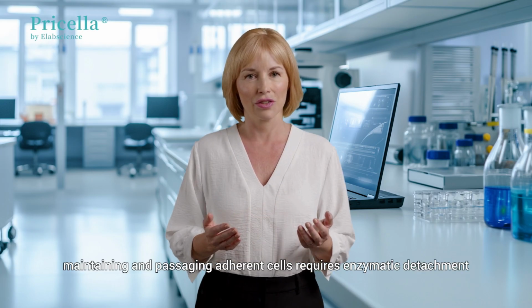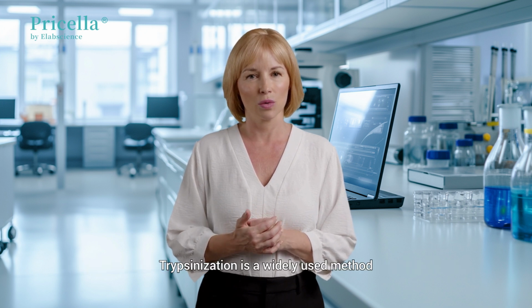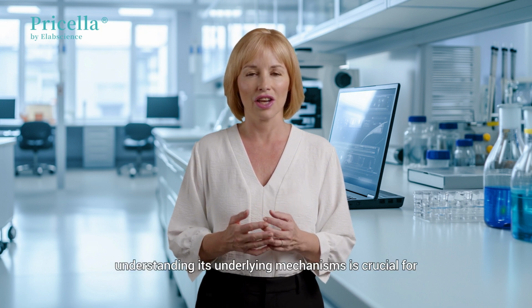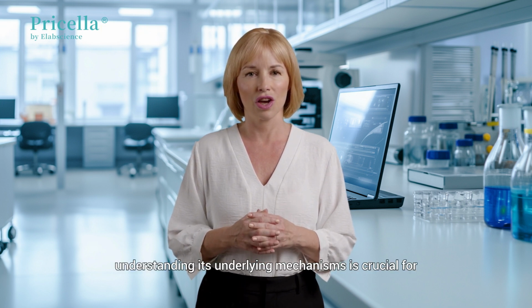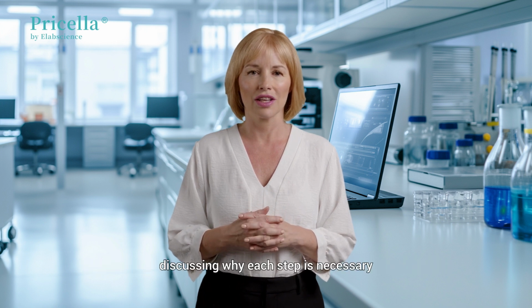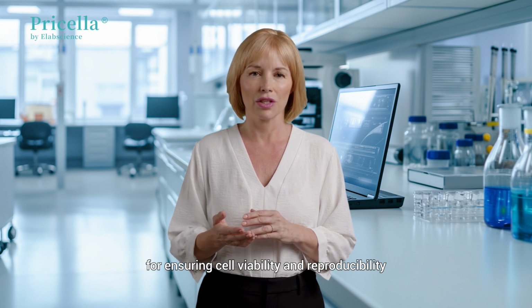In cell culture, maintaining and passaging adherent cells requires enzymatic detachment. Trypsinization is a widely used method, but beyond its routine use, understanding its underlying mechanisms is crucial for optimizing experimental outcomes. In this video, we will break down the biochemical principles behind trypsinization, discussing why each step is necessary for ensuring cell viability and reproducibility.